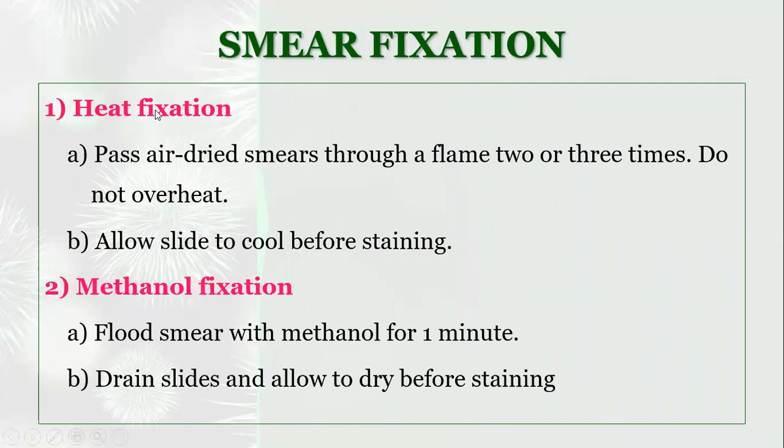Whatever smear has been prepared, after air drying, it should be fixed by the heat fixation process or methanol fixation. Heat fixation means the smear is passed over the Bunsen burner flame so that it causes death of the organism, as well as fixing of the organism to the microscopic slide.